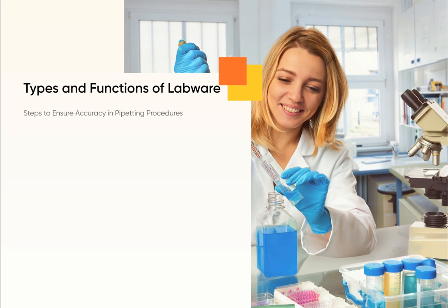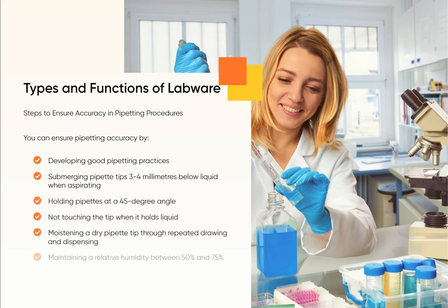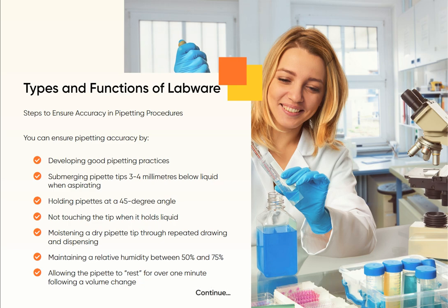You can ensure pipetting accuracy by developing good pipetting practices: submerging pipette tips 3–4 mm below liquid when aspirating, holding pipettes at a 45-degree angle, not touching the tip when it holds liquid, moistening a dry pipette tip through repeated drawing and dispensing, maintaining a relative humidity between 50% and 75%, and allowing the pipette to rest for over one minute following a volume change.